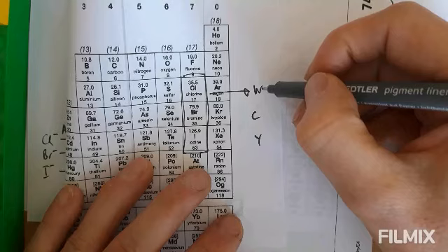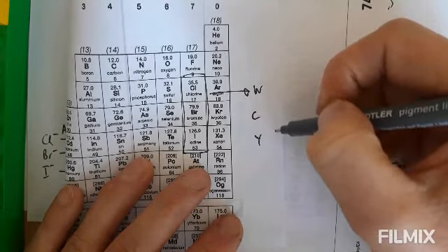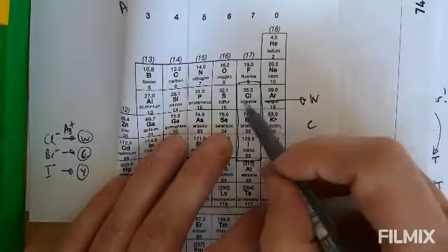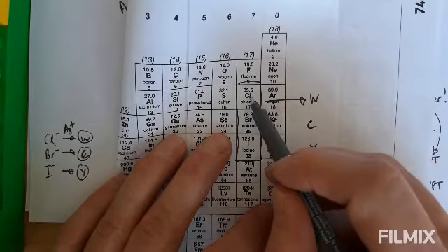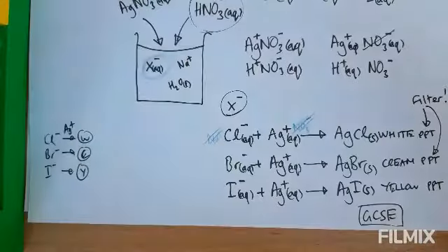Imagine somebody has got white, perfectly white teeth. The next one down, a little bit creamier. Maybe they need to brush their teeth more often. And then yellow teeth. It's getting more and more yellowy as you go down. White, cream, yellow. You can also remember that chlorine bleaches things. It bleaches things white. So as long as you remember that chlorine is white, then all you've got to remember is white, cream, yellow, and you'll have it sorted in your head. All right. So chloride and silver.